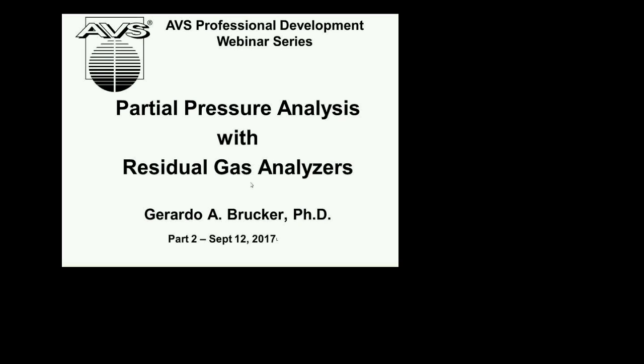They are high vacuum or ultra high vacuum, and they are using the RGA to figure out: is their vacuum system clean? Is this a high quality vacuum with only the species that I allow there? Are things going well? Am I going to hit my base pressure? Am I close to the ultimate pressure of the system, and so on?